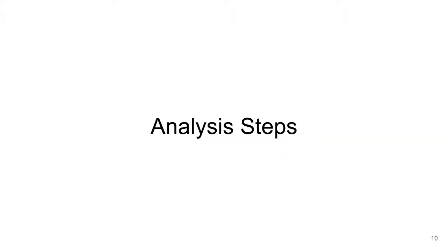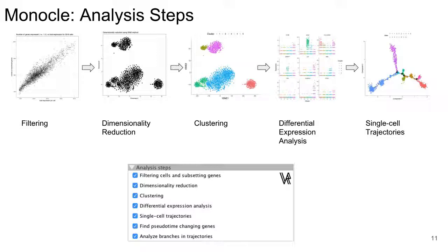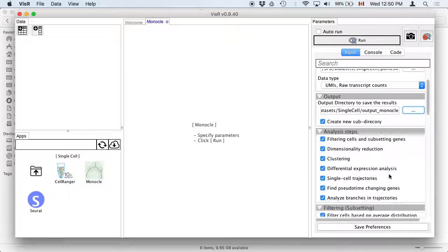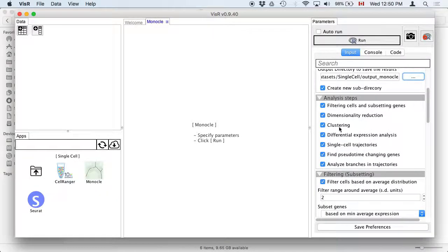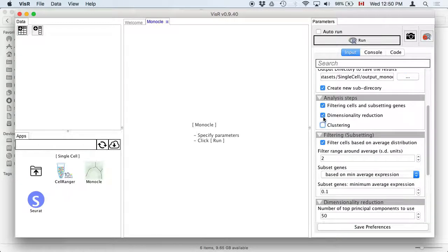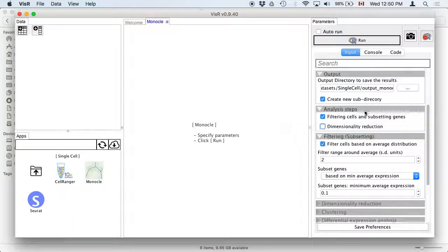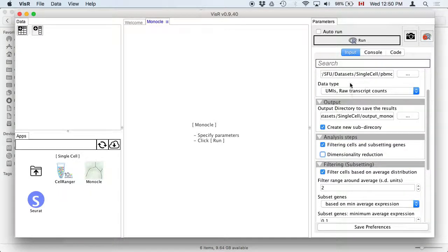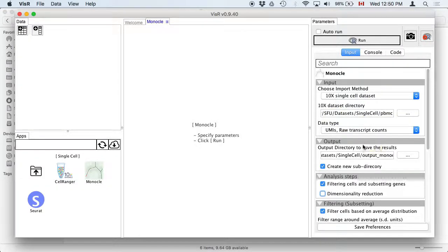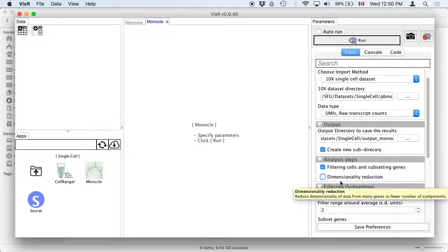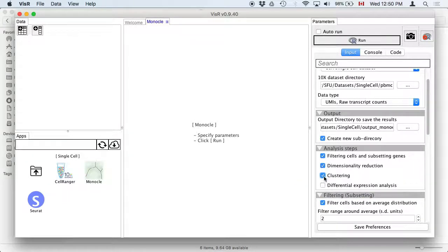Now let's start with the analysis steps. These are the main steps we go through. We have these analysis steps in the VizR app, and you can enable which ones you want to run. If you're using raw data, you have to go through all steps sequentially — you can't skip clustering and run differential expression analysis. However, if you chose to use an existing Monocle object, you could skip earlier steps since they're already done.